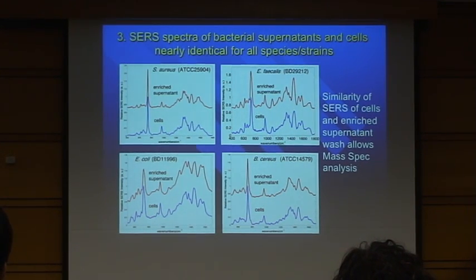But of course, we wanted to go further. We grow these bugs, we capture them whether they're growing in blood, urine, or media, and then we wash them in water. Bacteria are very hardy, so you don't have to put them in a buffer. Just still water, and they're fine. If distilled water was a problem for bacteria, we'd have a very ubiquitous antibiotic. So they're very hardy.